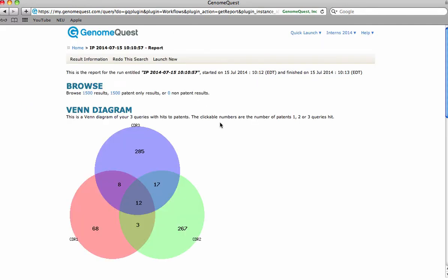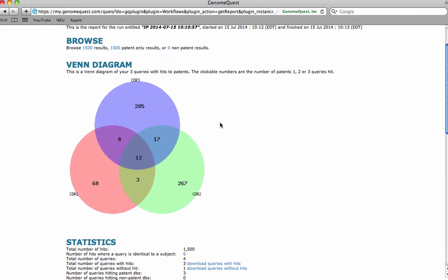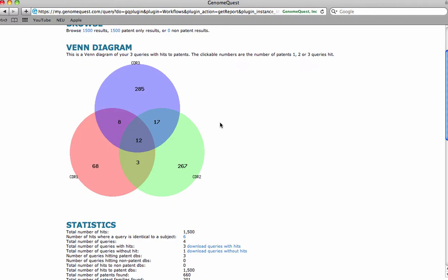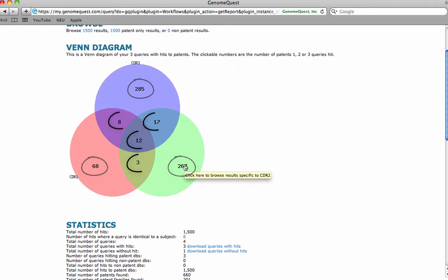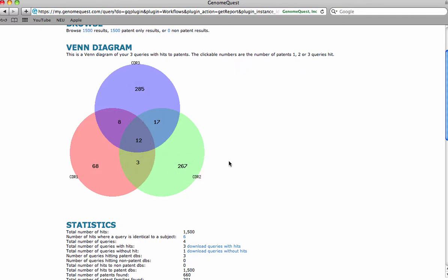A Venn diagram of your queries with hits to patents can be viewed. Each circle represents an individual CDR. The clickable numbers are the number of patents your queries hit individually or combined. This feature does not filter away any results.